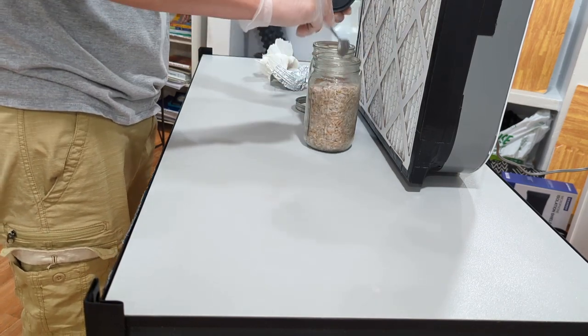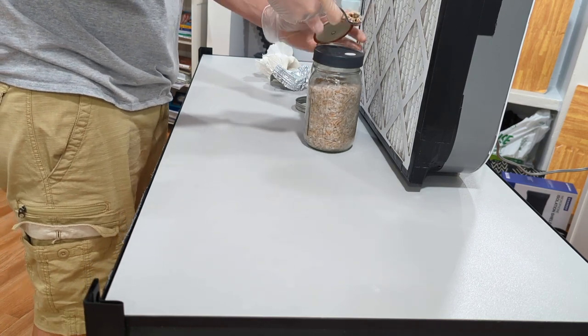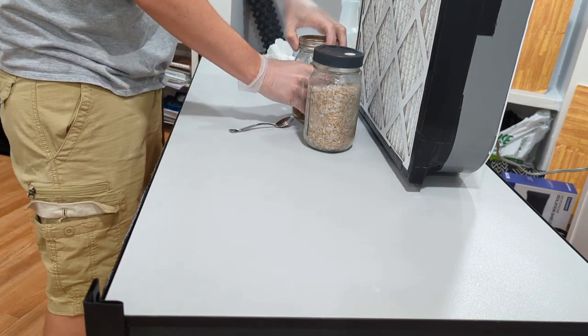With your colonized grain spawn, all you need is about a good teaspoonful to throw into your receiving jar, and that will colonize anywhere from two weeks to four weeks, depending on the strain.